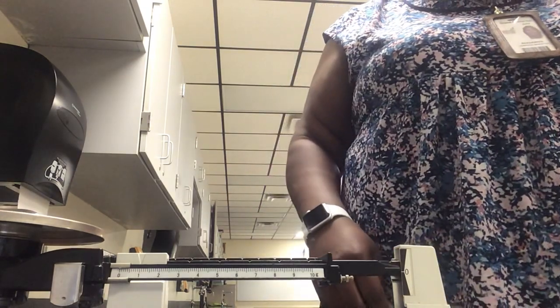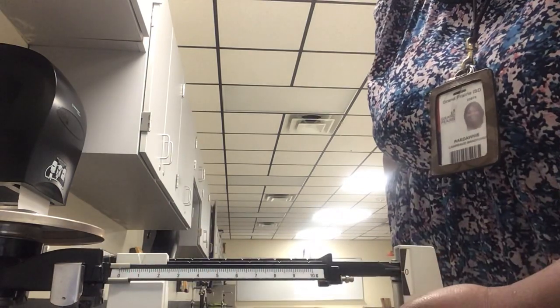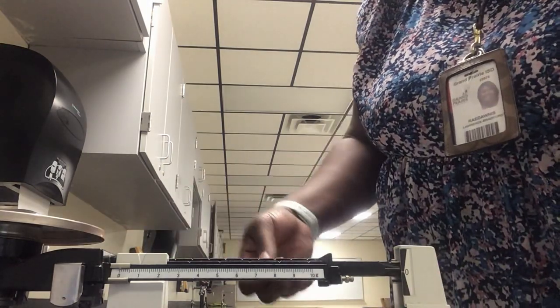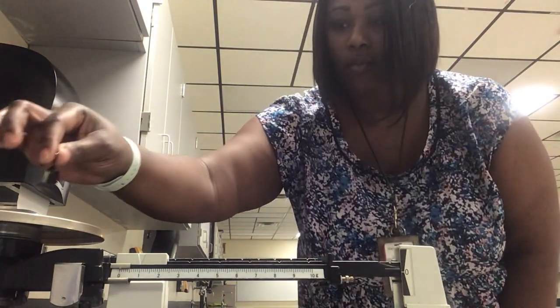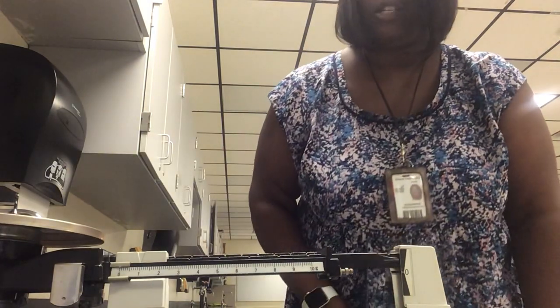So the way this works is we're going to utilize the one section. If it's too heavy for the single grams, then we're going to go into the tens, and then we'll go into the hundreds if it's heavy. I don't think it's that heavy, but anyway, we are going to put the irregular shaped item there. So I'm going to just slide this and kind of play with it.